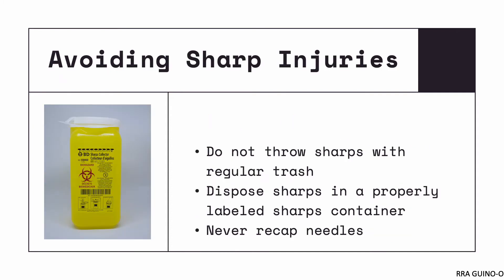In order to avoid sharp injuries, we can practice the following precautions. First and most important, do not throw sharps away with the regular trash, as waste disposal personnel might not know there are needles in the trash and could get finger pricks. Next, dispose of sharps in a properly labeled sharps container. The sharps container must be puncture proof, properly labeled with the word 'sharps,' have the biohazard symbol, have a cover to prevent spillage, and ideally not be made of fragile materials like glass.